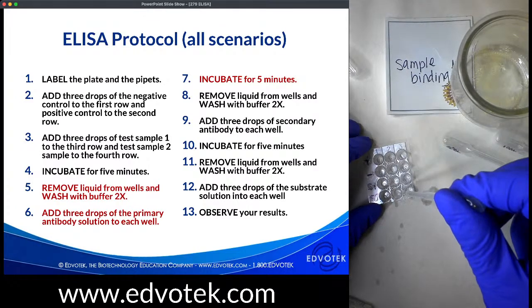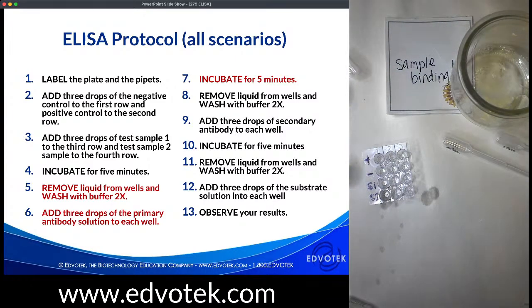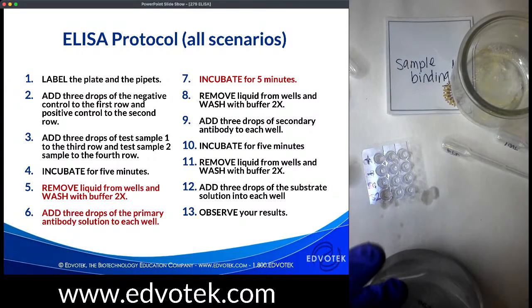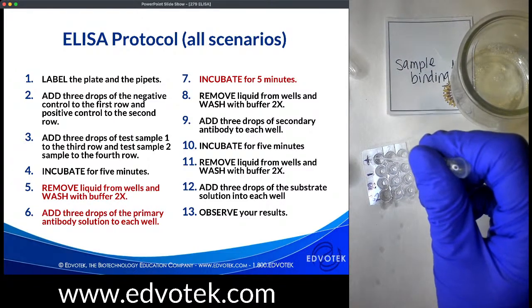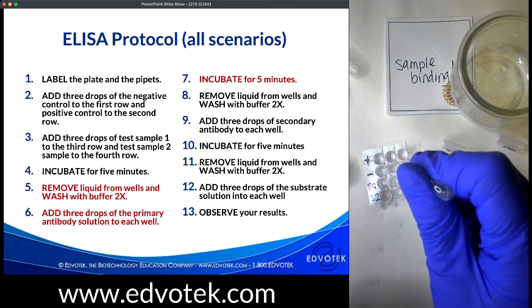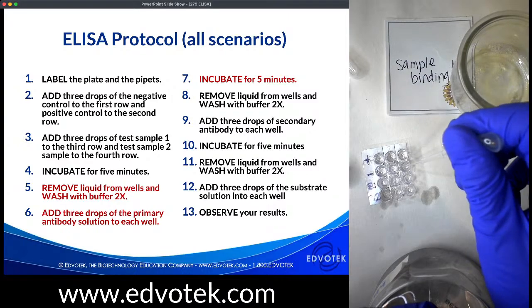We'll talk a little bit more specifically about lateral flow tests in a later slide. The lateral flow test is what you might be familiar with from a pregnancy test or a rapid flu test or a COVID test, where you spot a small amount of a sample onto a strip, and then you see the lines turn color.